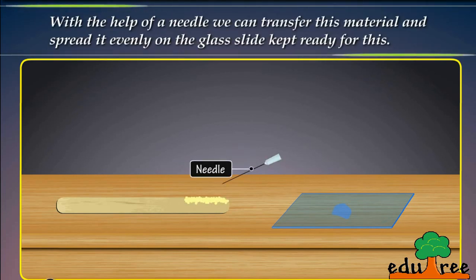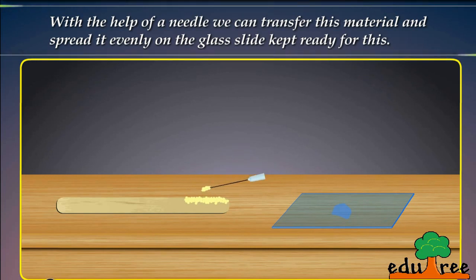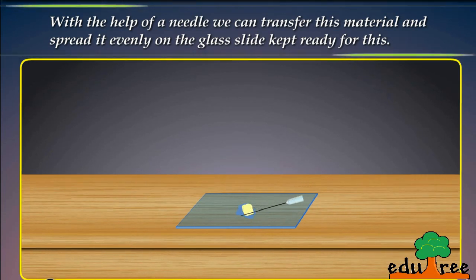With the help of a needle, we can transfer this material and spread it evenly on the glass slide kept ready for this.